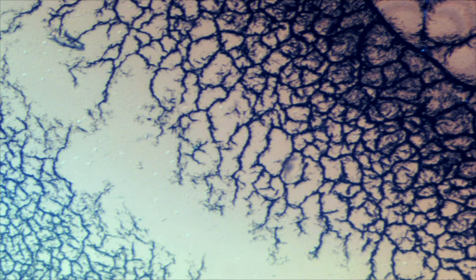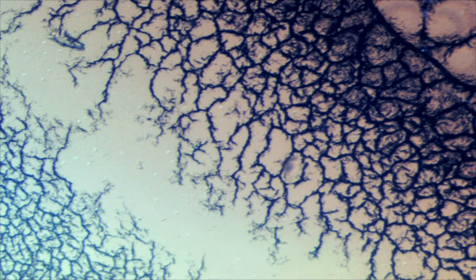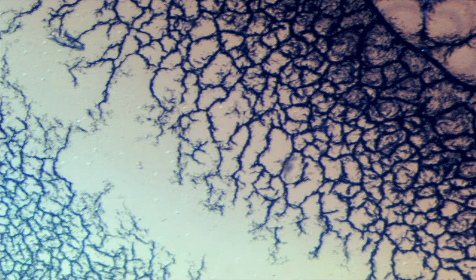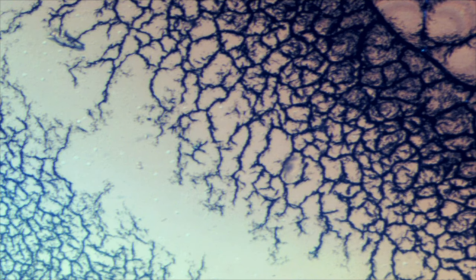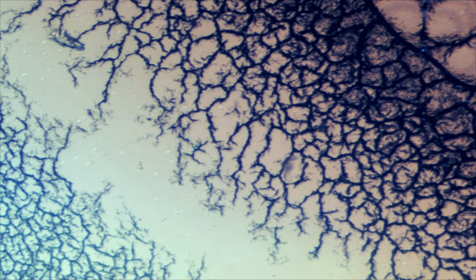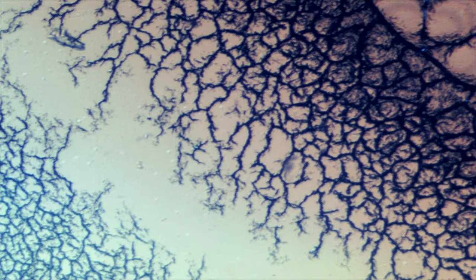Whoa, look at that! You know what it kind of reminds me of? It kind of reminds me of lightning bolts or something scattered, or you know what, cracks in really soft dirt that get all cracked up. It kind of reminds me of that too. That is super interesting. Let's see if we can move it around a little bit. I think that all these tiny little ones right here are the individual actual cells. It's kind of hard to tell because they've already decayed so much, because this is a slide from a few months ago.